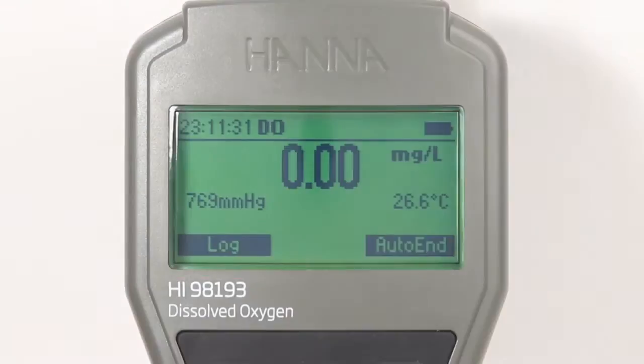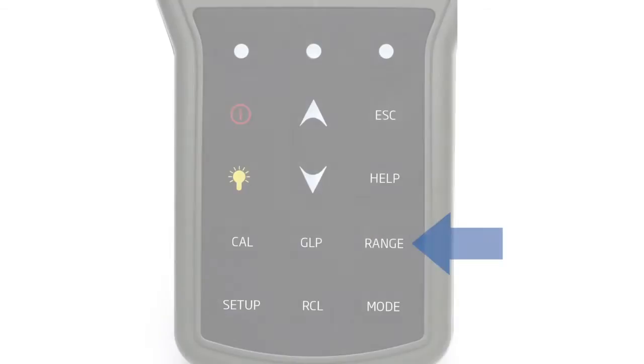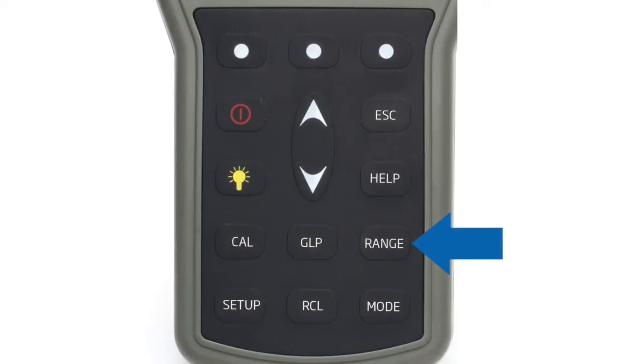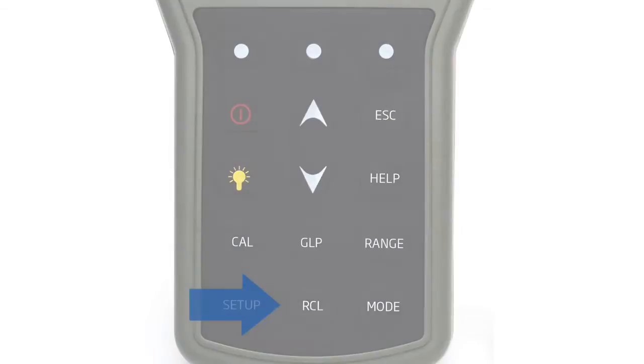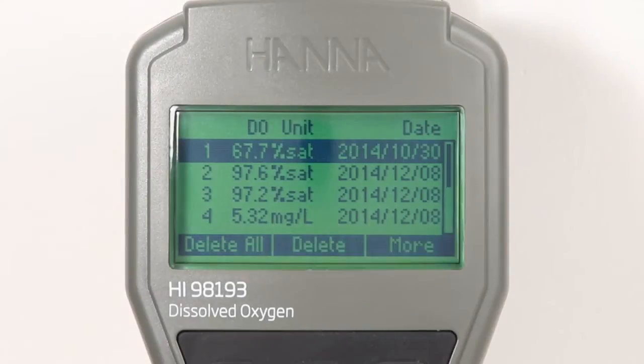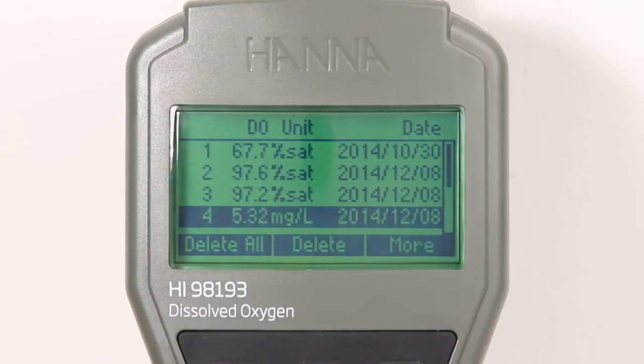To switch between DO, BOD, OUR, and SOUR modes, simply press the range button while in measurement mode. A reading can be logged by pressing the virtual log key. Stored data is easily recalled by pressing the recall button. The HI-98193 can store up to 400 measurement readings.